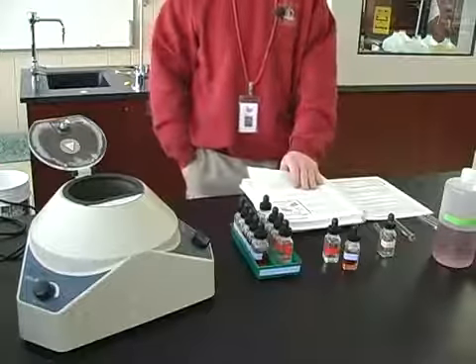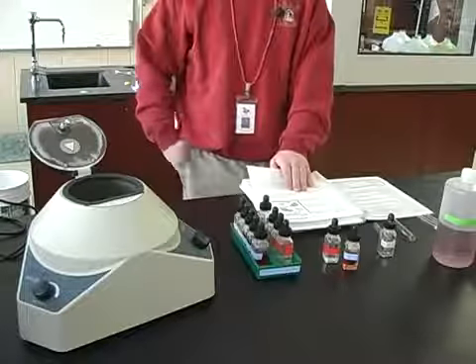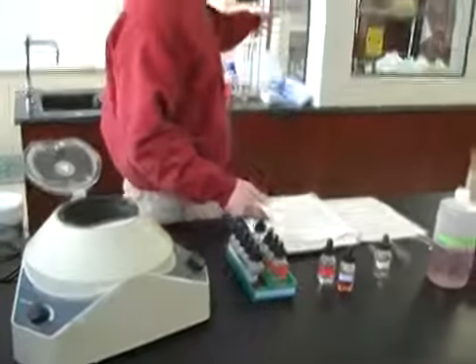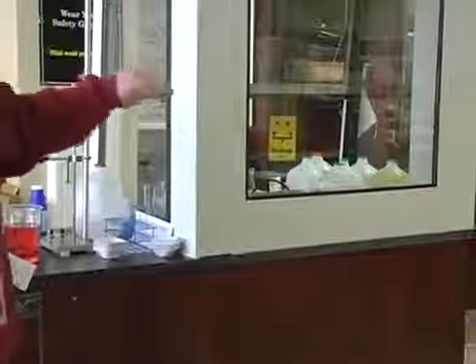Disposal of the solutions. Many of the solutions and ions being tested are poisonous, and so in the fume hood over here we'll have a really large container that says waste solution, so don't dump any of that stuff down the drain. Just go over to the fume hood and dump everything in there.